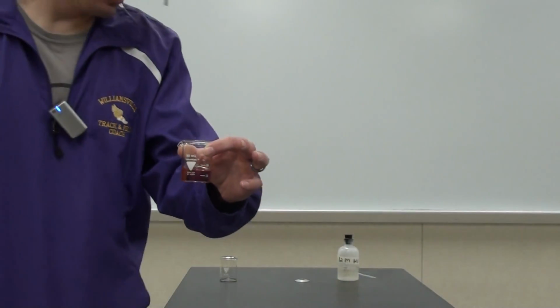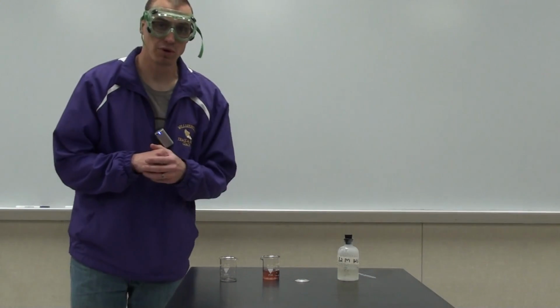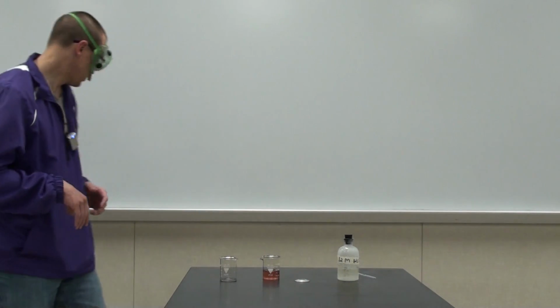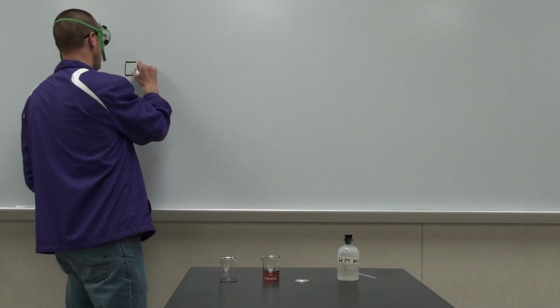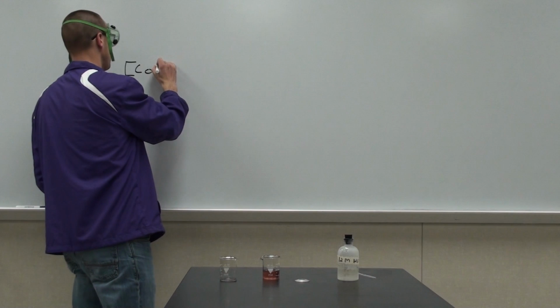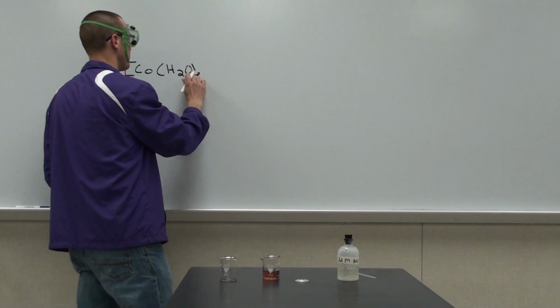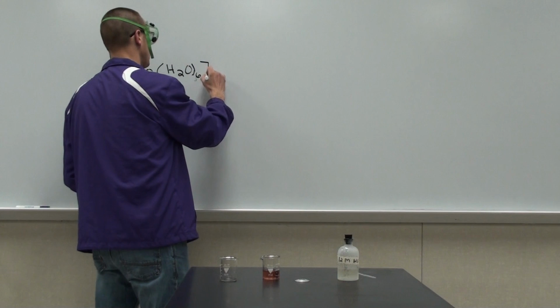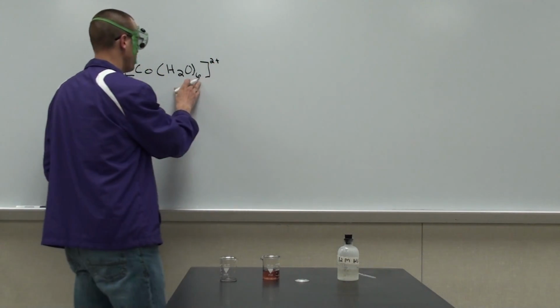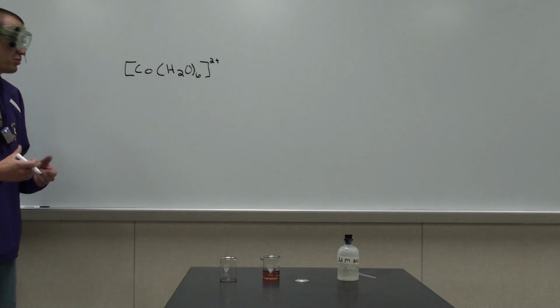Before we get into this demonstration, I want to put up the chemical equilibrium equation that we're going to be working with for this particular solution. So let me go ahead and go to the board. The first thing that we have here is our cobalt hexa aqua complex.